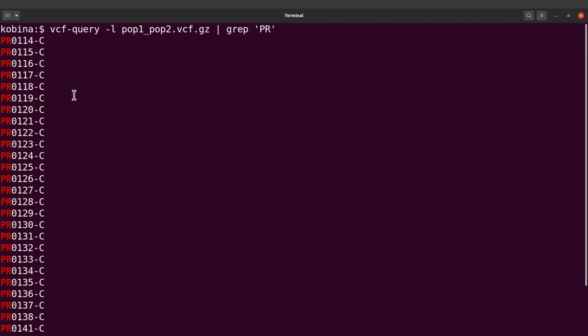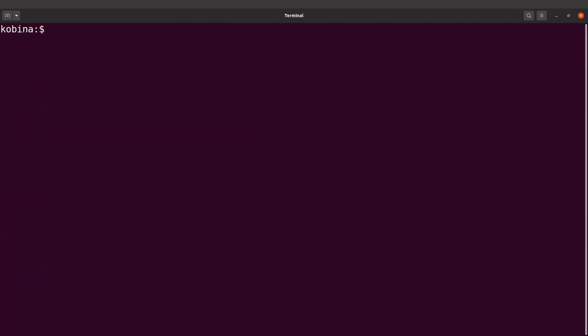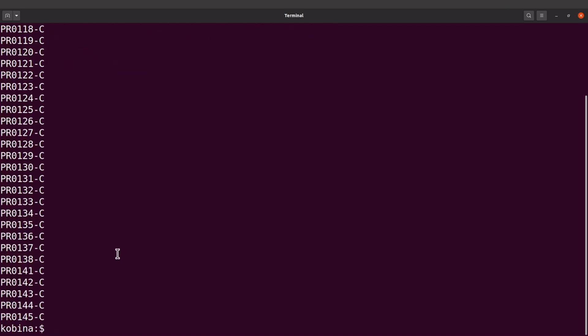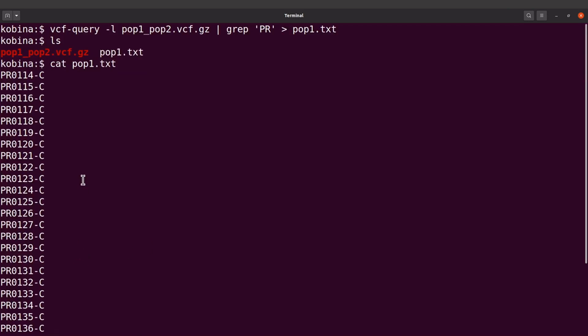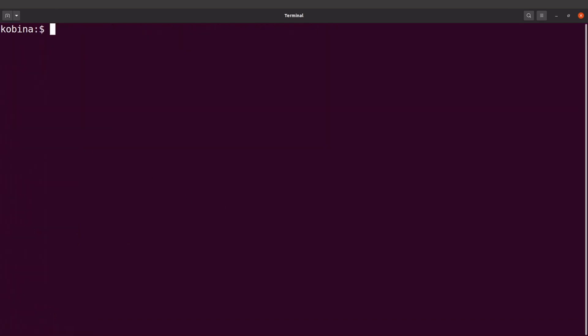But these were displayed, we want to save to an output file. So I'll also use this greater than symbol here and I'll say pop1.txt. That's our population, the first one. Okay, that's population one. So if I do an ls I'll see pop1. That is what I have here. I've used the cat command to display it. Okay, that's for pop1.